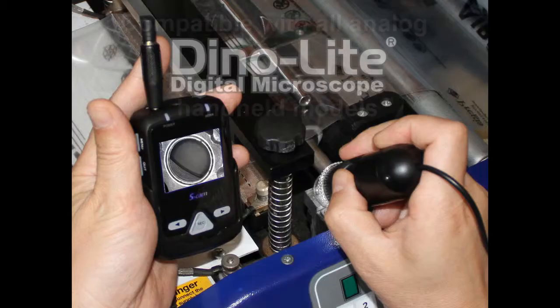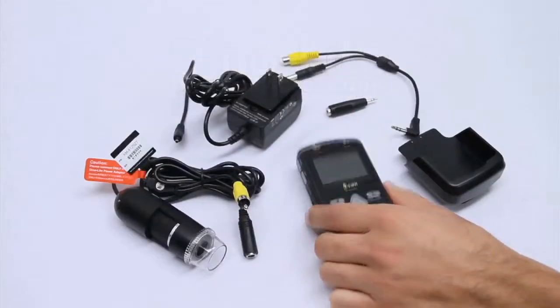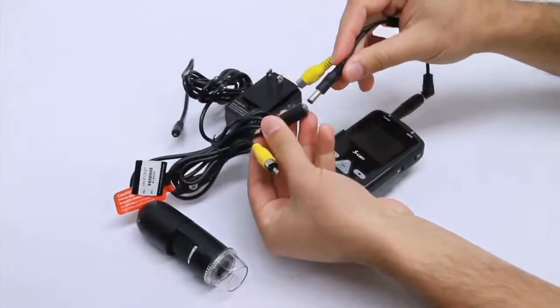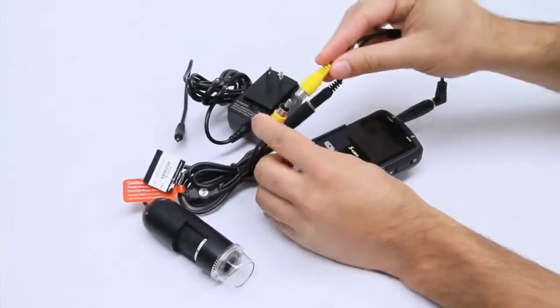Introducing our most portable unit, the MS-D09. To connect the power and data cords, press the same colored connectors together. This unit also comes with an AC adapter.